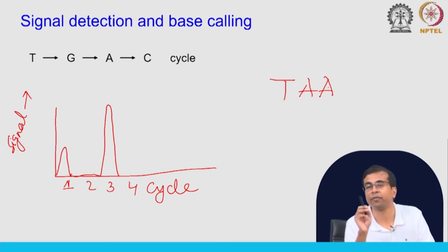You will get 2 pyrophosphate, you will get everything happening in double. So, this should give you twice the signal intensity, twice the intensity of light that you would get if you had just one base. So, that is what we see. You can now calibrate the detector, saying, okay, if you see this much signal, this means you have addition of 2. If you see even higher signal, there is addition of 3 bases, and so on.